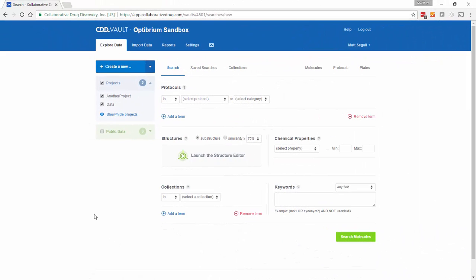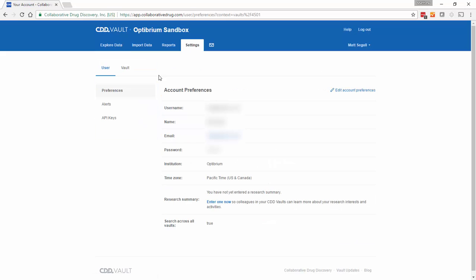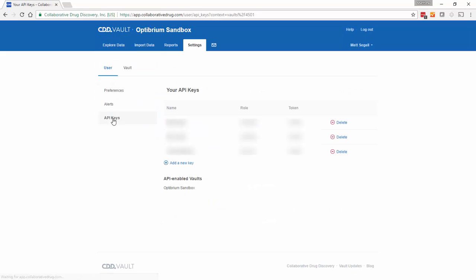The first time you use the CDD Vault script in StarDrop, you will be asked for an API key. This can be easily created in CDD Vault by going to Settings and selecting the API key option.